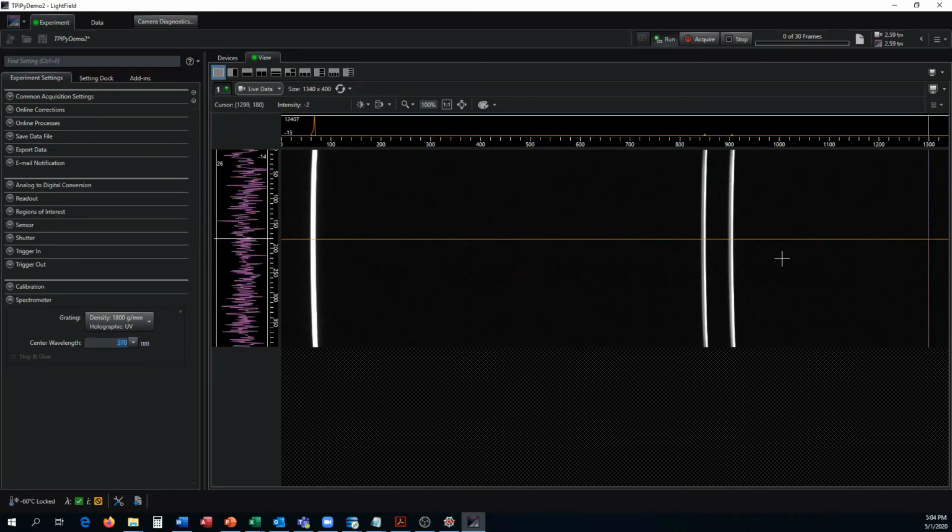So as all this is happening, we're gonna acquire all the frames, and we're gonna calculate the centroids at each frame, and we can verify that we're getting the correct number, which will prove that we're grabbing the frames live and doing a calculation on it in real time and getting accurate results. So that's what this script is going to do.